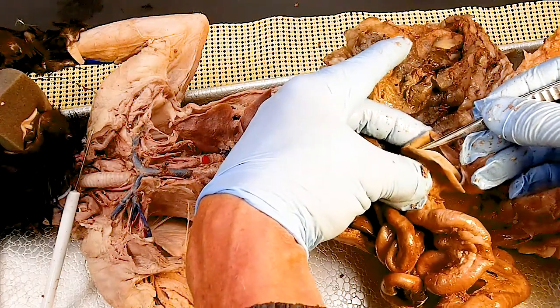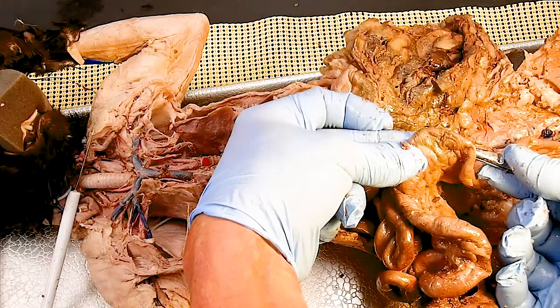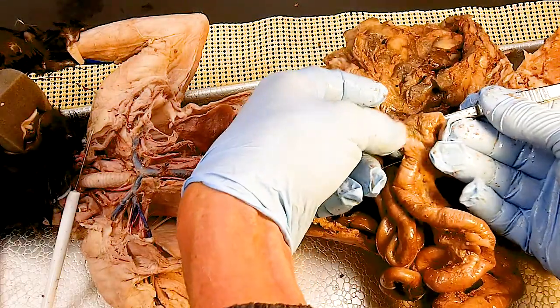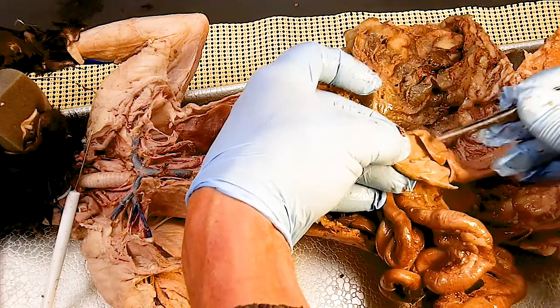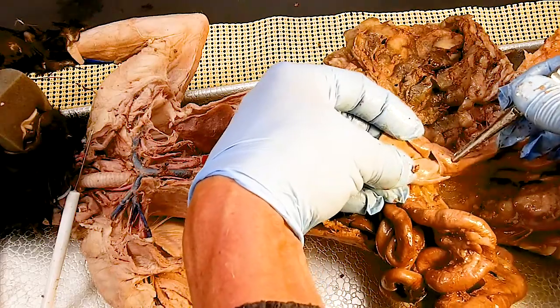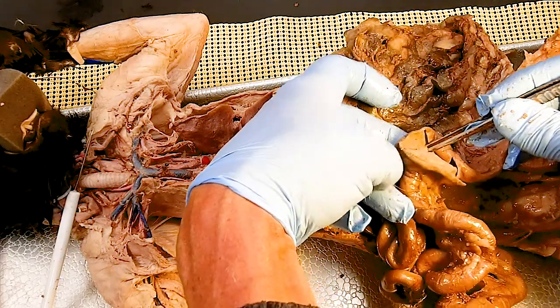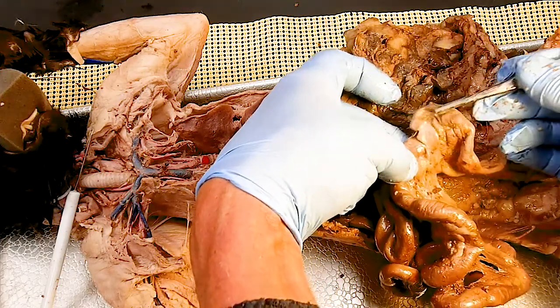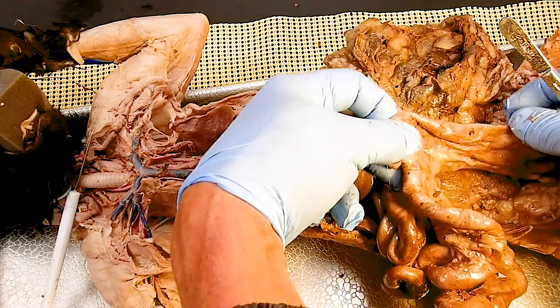This other bit going in here, that little dead end sort of pouch, it's not very long, so maybe a centimeter in the cat. That's the cecum. So here's the ileocecal valve. So this is the cecum, the dead end pouch. The rest of this is colon. So you've got three things here: the ileocecal valve, the cecum, and the ileum. And of course, there's your large intestine or colon.